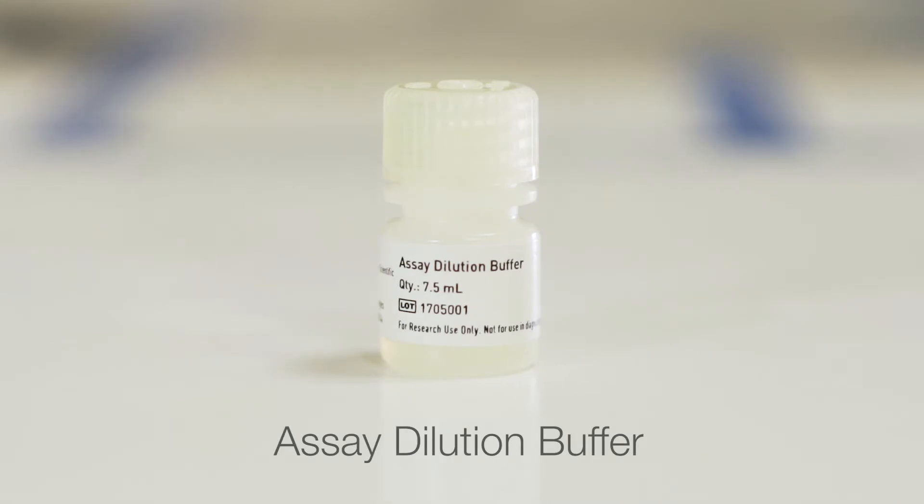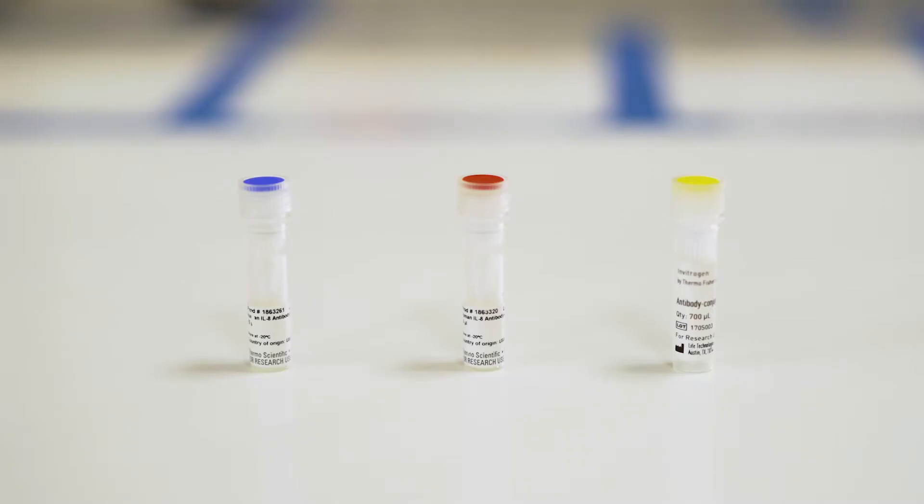The first bottle is the assay dilution buffer used to dilute standards and samples. The three tubes with the blue, red, and yellow caps are antibody conjugate A, antibody conjugate B, and a dilution buffer that will need to be mixed.